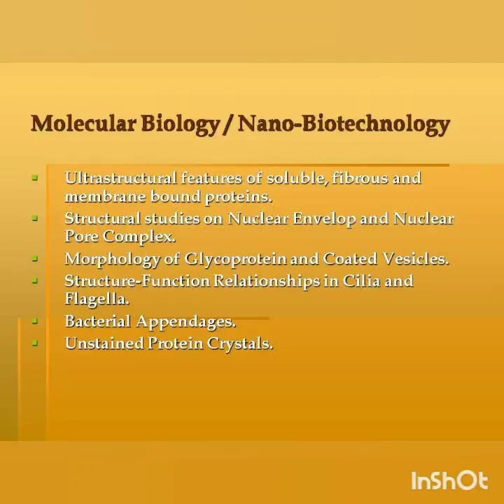Morphology of glycoprotein and coated vesicles, structure function relationship in cilia and flagella can also be studied in detail. Bacterial appendages can be studied in detail, and unstained protein crystals can be studied with the help of electron microscopy.